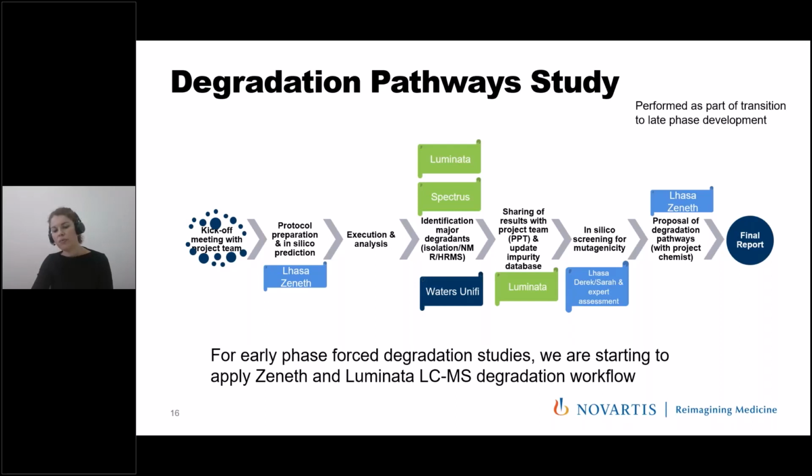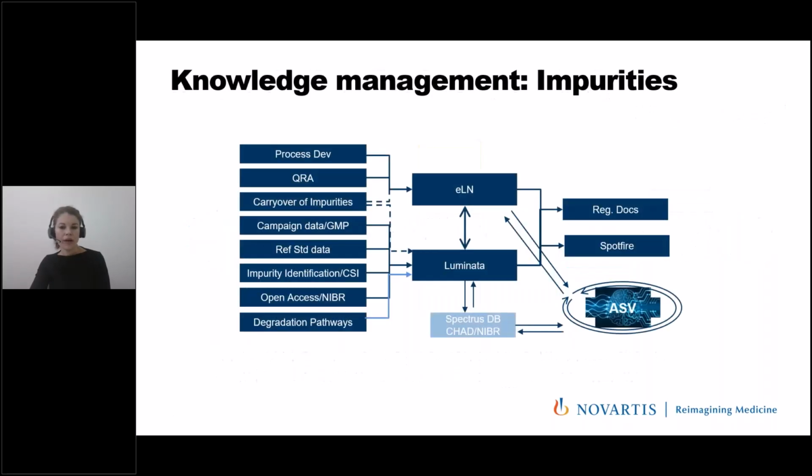And here, besides literature, of course, we also use the Zeneth tool. This is a little bit our idea of how we would then manage all this input, be it from the degradants or from the impurity identification activities.